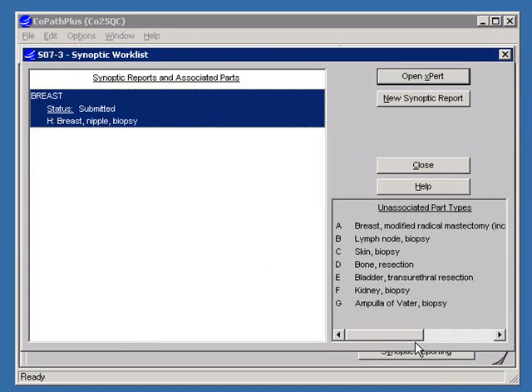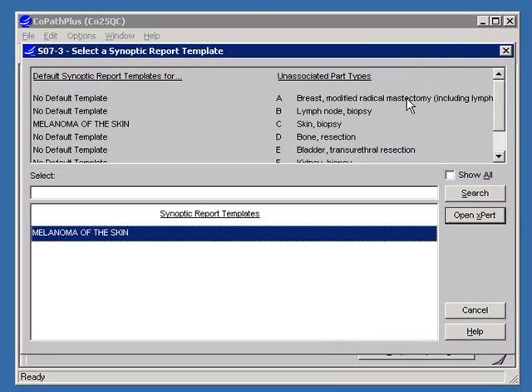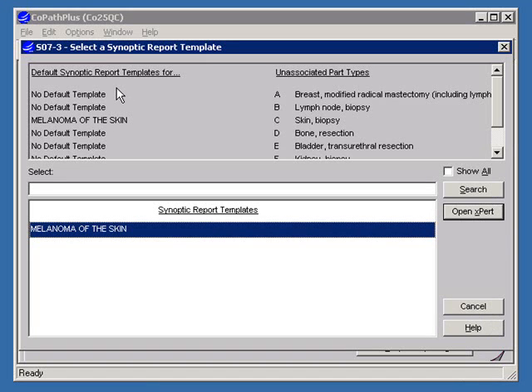We have launched the Synoptic Worklist. At the right side on the bottom, we can see all the part types that do not have synoptic reports completed for them. Here, we can choose to work on an existing report or open a new report. Default synoptic templates can be assigned in the CoPath library for each of the synoptic reports. As you can see in the list of part types for this case, the system has not assigned default checklists for the majority of our part types.